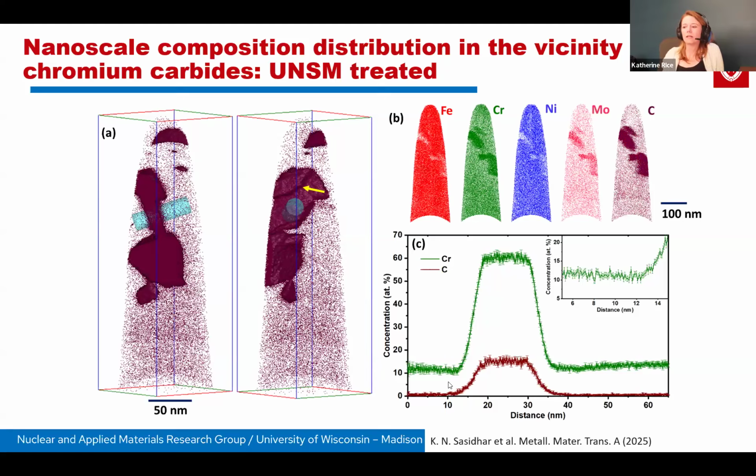As they keep rolling in, I had a question about the weld points. Are you sampling any different chemistry in those heat affected zones from the weld? How big are those anyways? I don't have a good sense of that. That's going to be extremely dependent on the geometry of the particular weld. In this particular case, the canister weld, it's very big.